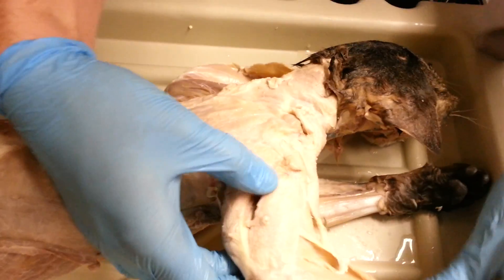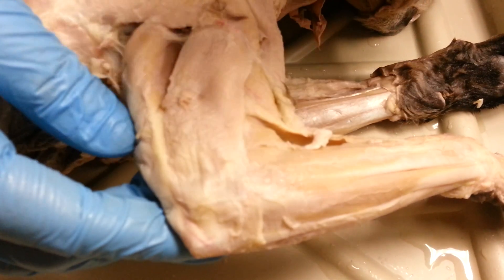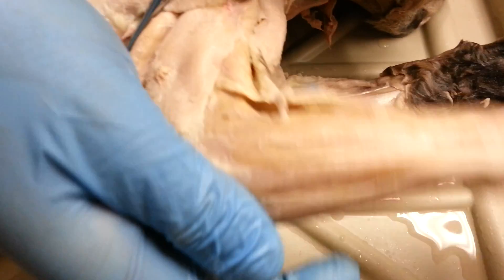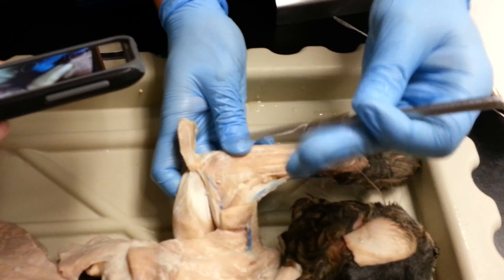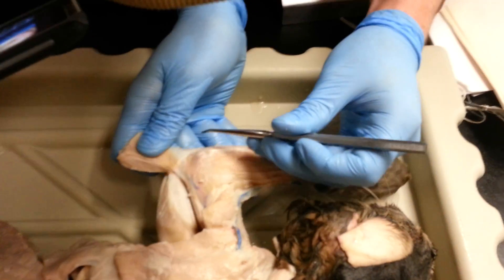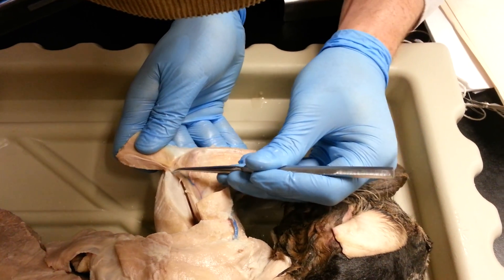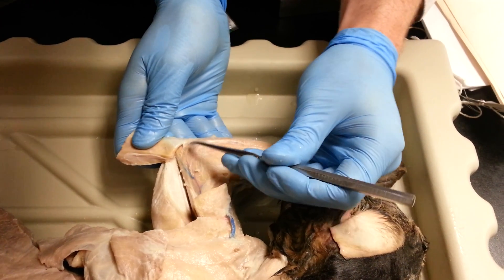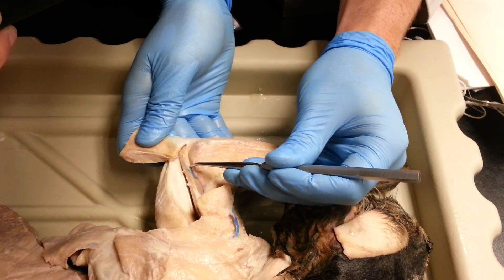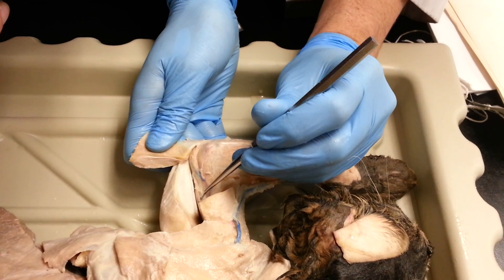Moving down the arm, we have the triceps brachii. This is the lateral head. This is the long head. And underneath these — this is the lateral head reflected. This one right here is the anconeus — it wraps around the elbow. And then we have this one right here, which is the medial head of the triceps.